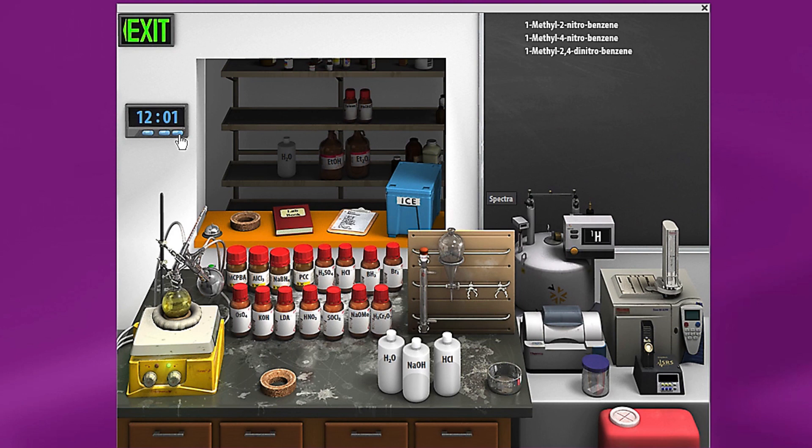We'll advance the time just a couple more minutes as long as needed until we see something collect. Okay. So 222 Celsius. We have something here in our collection flask. We have the two nitro benzene product. Let's see, there may still be some of it here in the flask. And there is. We have to continue until we can drive it all off.